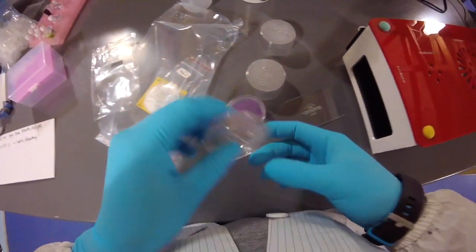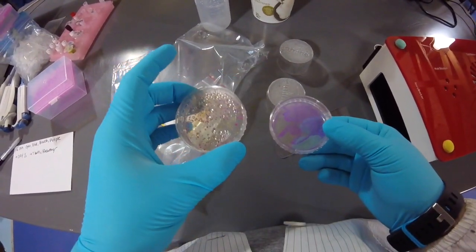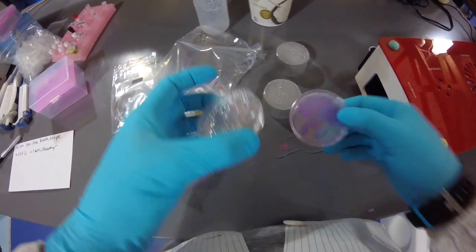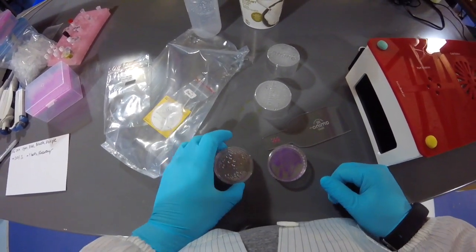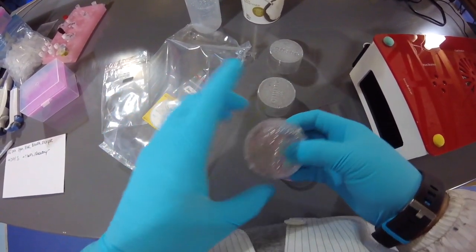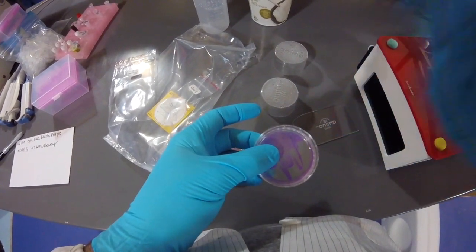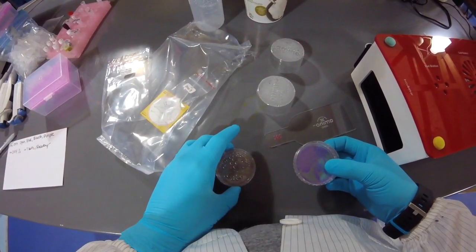Okay, so that basically wraps it up. Maybe just a quick summary. On day one, you created some LB agar Petri dishes where you mixed some LB agar powder with some boiling water so that the boiling water could dissolve that agar. Once you poured it into the plates, it cooled down and solidified into a jello-like substance. You made a non-selective plate and 3 selective plates on that first day. The non-selective plate was used to streak out some blank cells, which are cells that aren't engineered, so that you could get single colonies of those bacteria. On the other selective plate, you did a negative control, which you streaked with blank cells. In that case, the negative control was that the blank cells should not grow because of the antibiotics. That's exactly what we saw after we incubated those for about 16 to 20 hours, if I remember correctly.